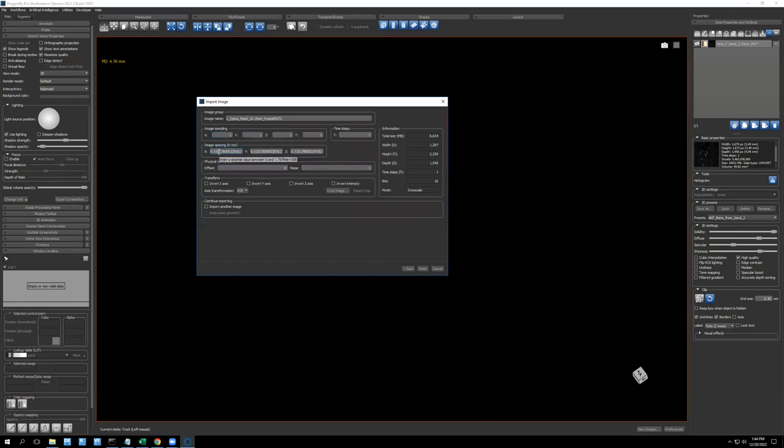Okay, so pause. Weirdly, the size is already in here, but it could be because this TIFF stack is from Dragonfly. Usually it's not. So usually this would say 1, this would say 1, this would say 1.